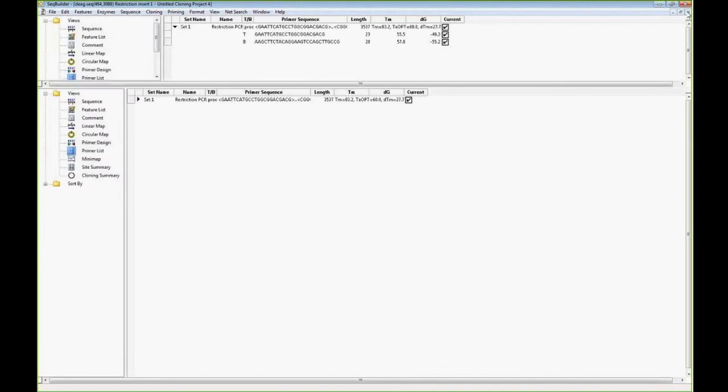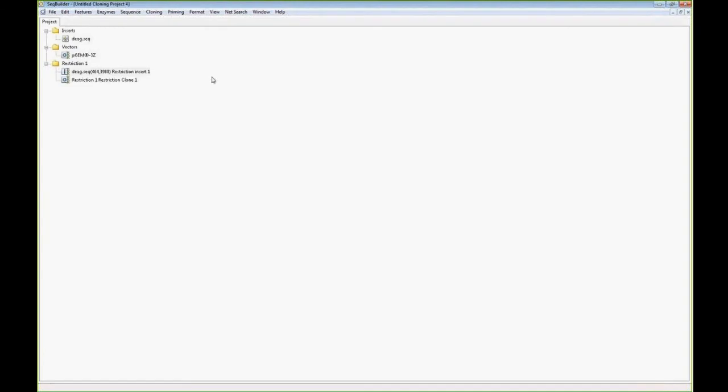Great, thanks for that explanation about how primers work in this cloning workflow. And before we end, we have one more question, and that is, how can I see the expressed protein or product if I want to assess codon usage or size? Oh, that's a great question.